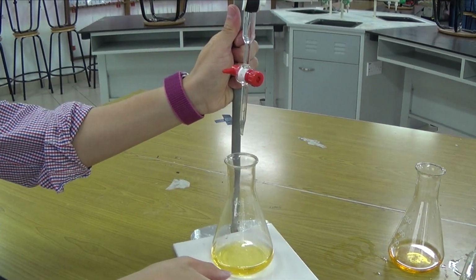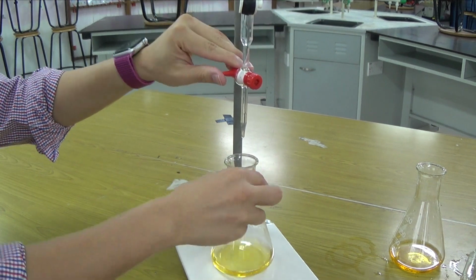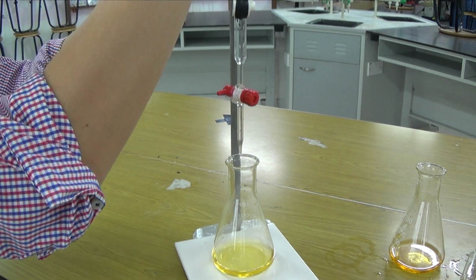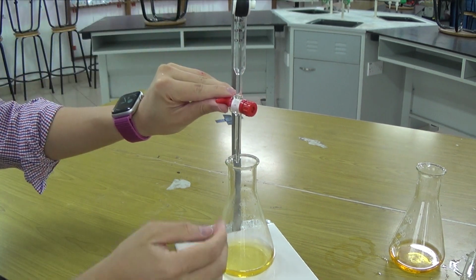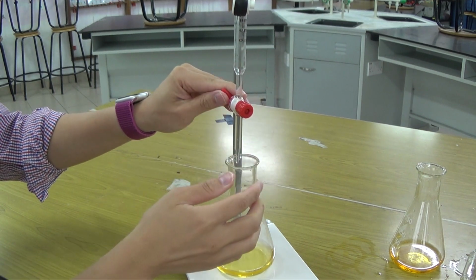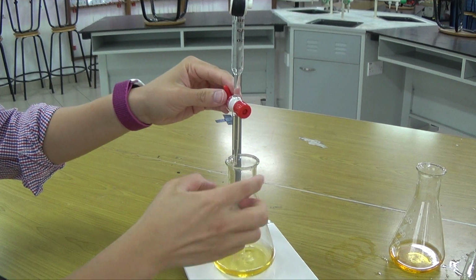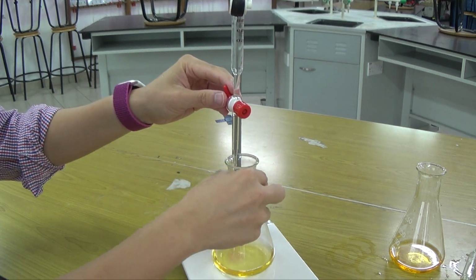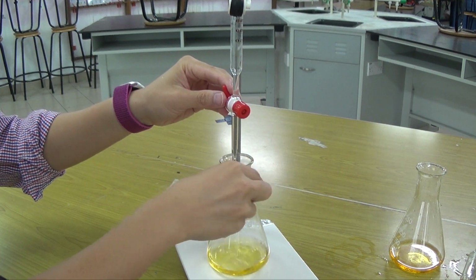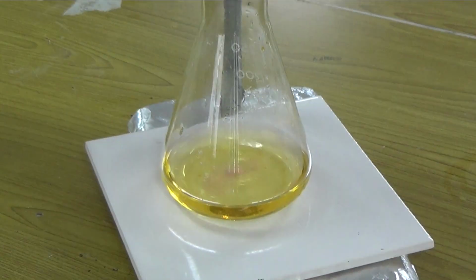Technically speaking, I should be standing up when I'm doing this, but it's a bit tricky. All right, so I want this to be a bit there. So my eyes are no longer on the burette. I just need to get it drop by drop. This is the most difficult thing, I guess. Okay, so that is drop by drop, and it won't be in excess yet. Once it is drop by drop, then you swirl gently. Let me just zoom in on the color change.